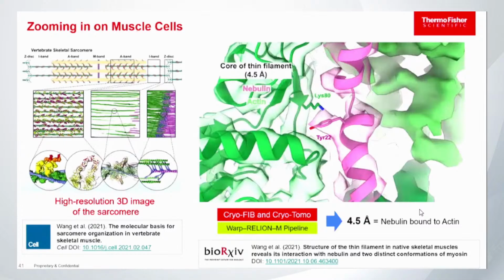Believe me, when I started doing tomography probably 10 years ago, the best you could get by cryotomo was probably 15 to 17 angstroms. And that was already like, wow, champagne, celebration. Right now, we are getting to 4 angstroms quite easily, depending on your sample, okay? Not every sample is the same. It's heavily sample dependent, but the technique is getting there.